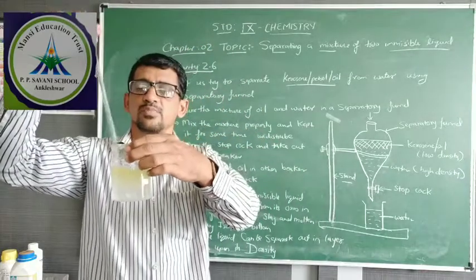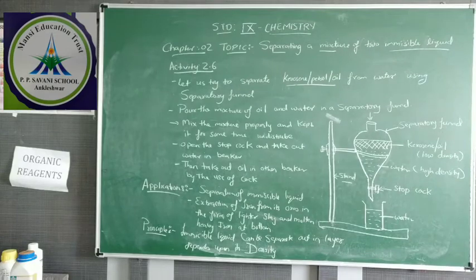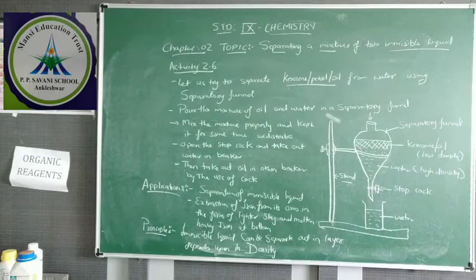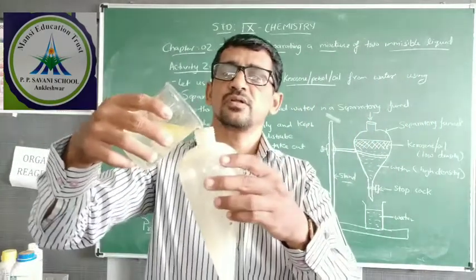Then how do we separate it? With the help of the separatory funnel.